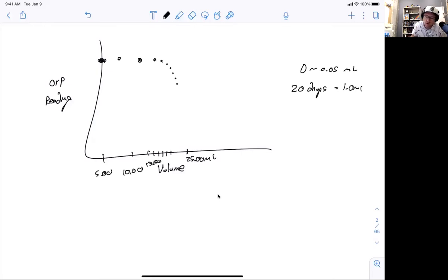And on your first one, you might find that you missed the equivalence point. You were still adding a milliliter and all of a sudden it's down here. And then you're still doing a milliliter and it's flattening out again. Now you could go back to 5 milliliters, so you could go exactly 30.0, 35, 40. Once it's really, really flat, you don't need to go all the way to 50. You could if you wanted to, but these two right here, it was over. So I just used these last 5 mils and didn't get any extra information.